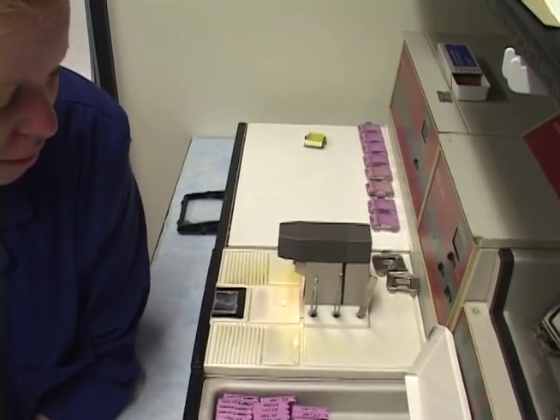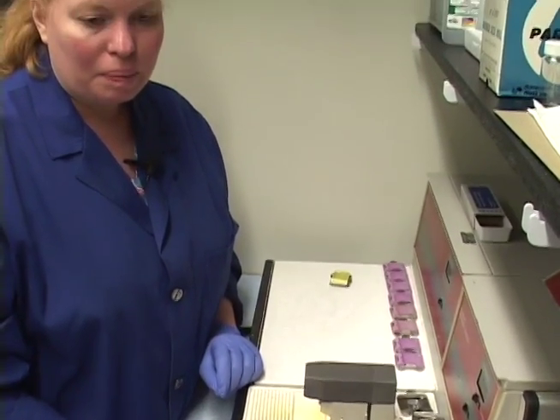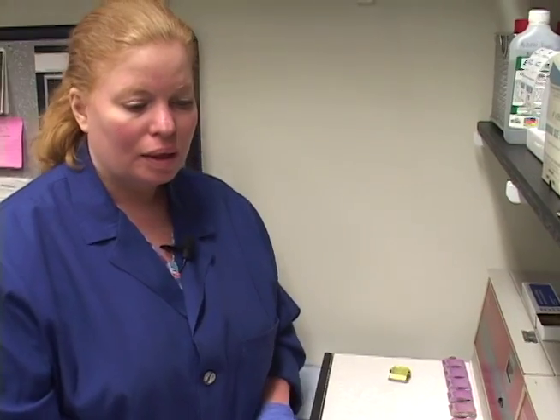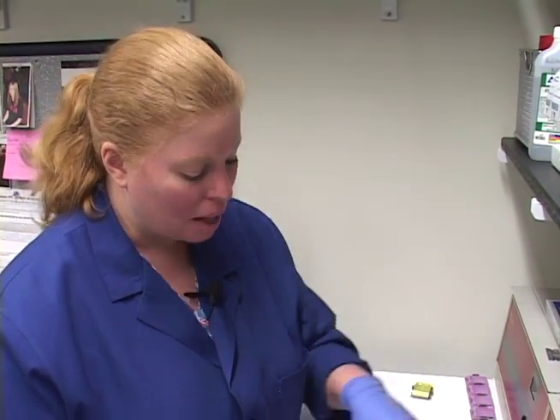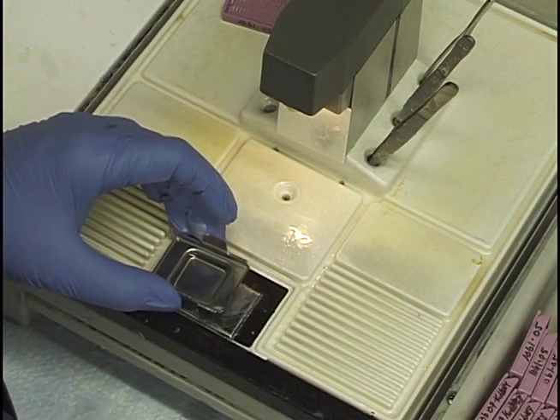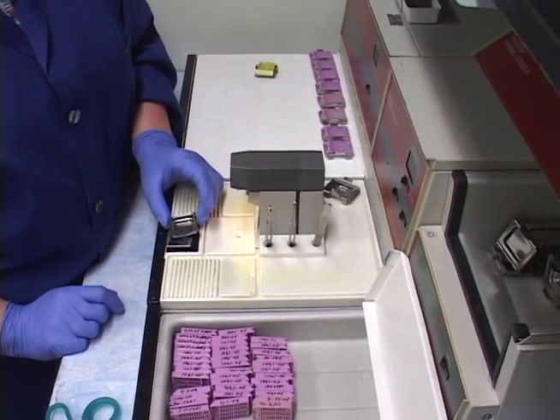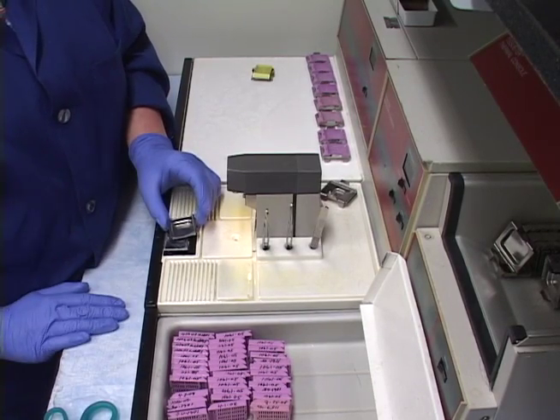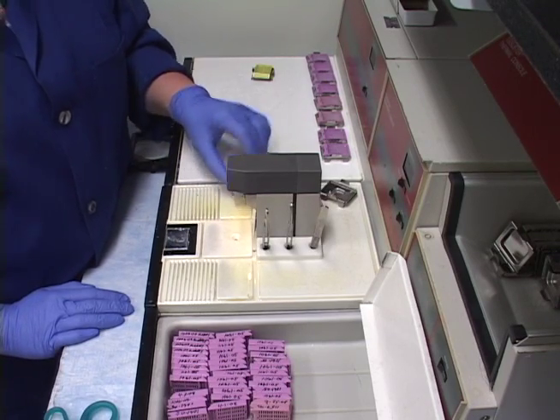For skin specimens, you're going to want to embed at a slight angle — flat on the bottom of the mold, but at a little bit of an angle. The reason is that skin has several layers and hair, and you want the knife blade to cut through one part then continue traveling so a fresh part of the blade is always hitting the tissue. That gives you nice sections.